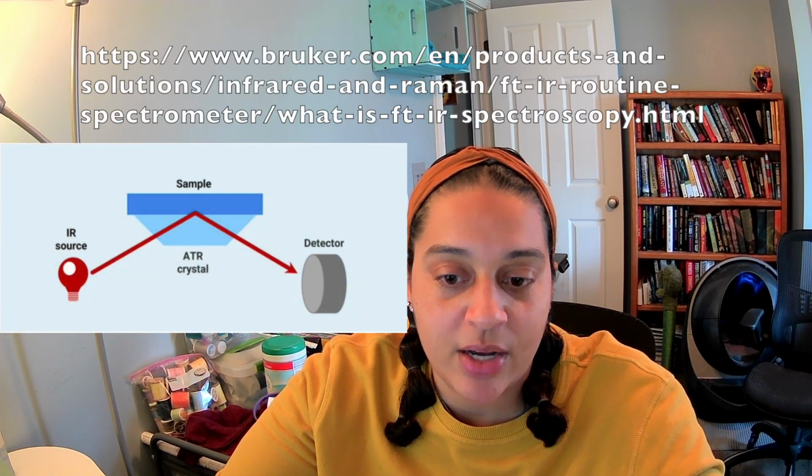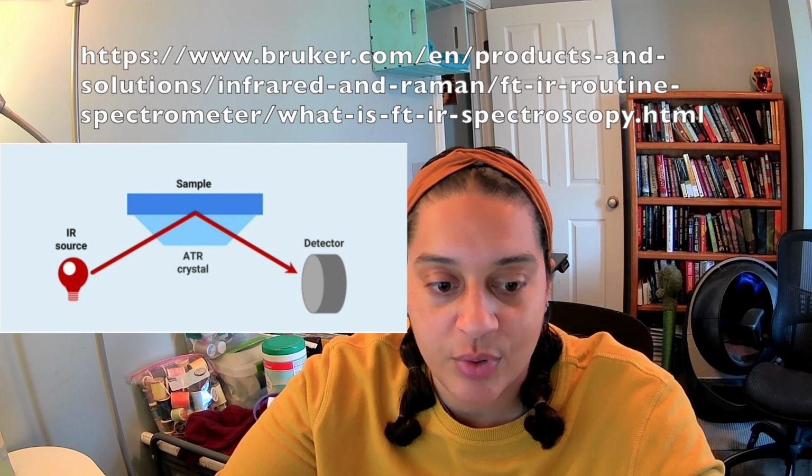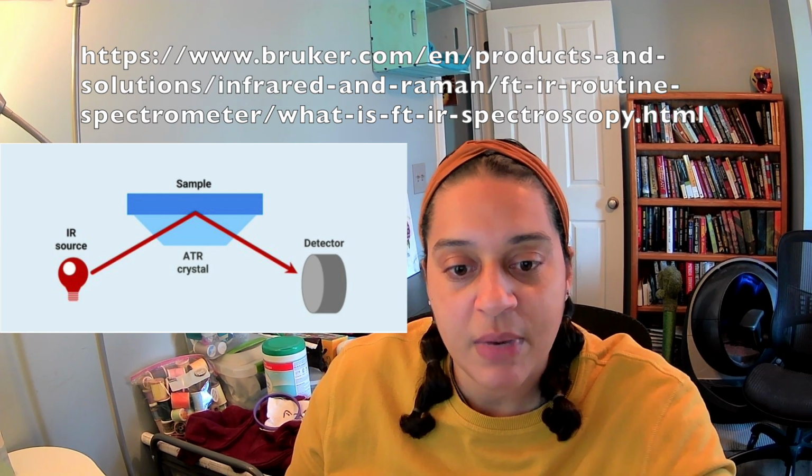The next measurement technique is called attenuated total reflectance, or ATR. ATR is possibly the most widely used technique and has all but replaced transmission. The FTIR instruments that I have used have all employed this type of measurement. The sample is essentially squished by a crystal and the light passes from the source into the crystal to the sample, then back through the crystal on its way to the detector. With this method, light doesn't actually pass through the sample. The frequencies not absorbed will more or less bounce off the sample, and this method also requires minimal sample preparation, and the sample can be recovered after you're done with the analysis.